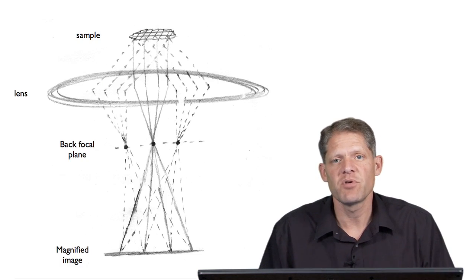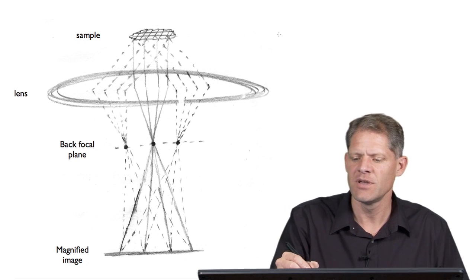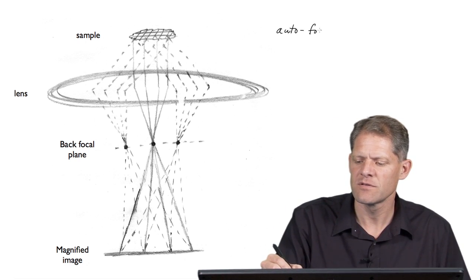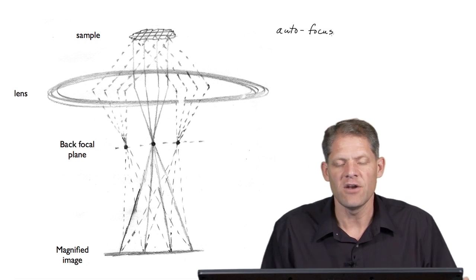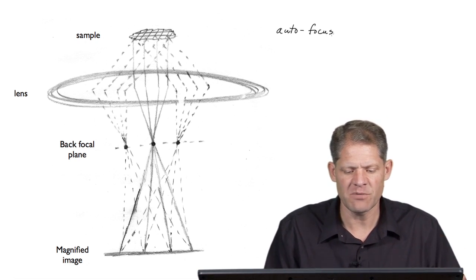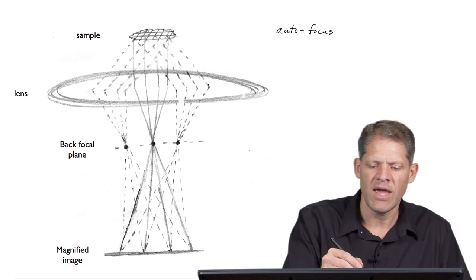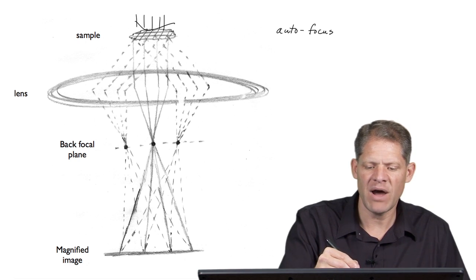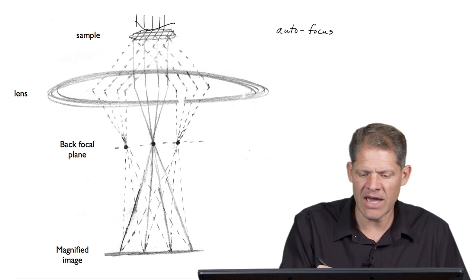Now the other imaging parameter that we'd like to be able to set automatically is focus. So how can we automatically focus an object of interest? And in order to explain that, let me call our attention back to this diagram, where imagine we have a sample and there's an incoming beam, and this beam is scattered by the sample. Here's the objective lens, which focuses that scattering.